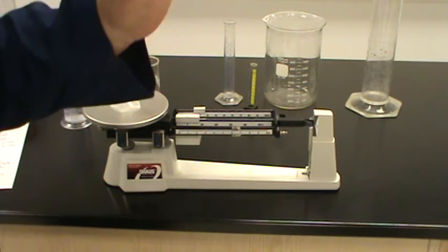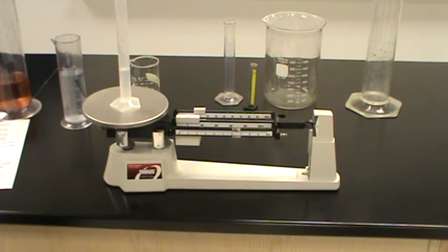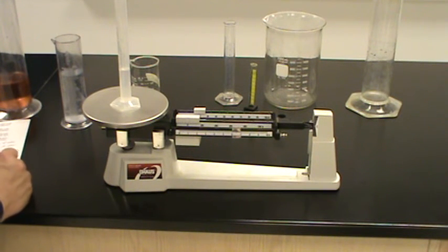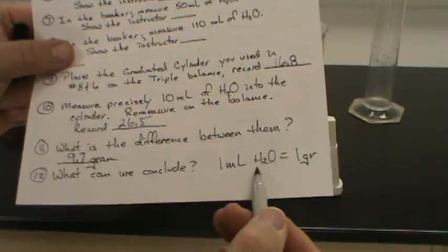We are 0.3 grams from proving our point. So for me, we can conclude that 1 milliliter of H2O equals 1 gram of mass. And that's what we're going to conclude down here, is that 1 milliliter of H2O equals 1 gram of mass.